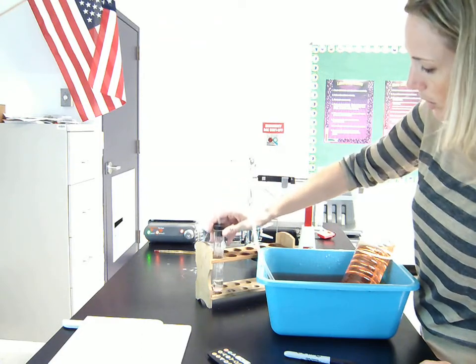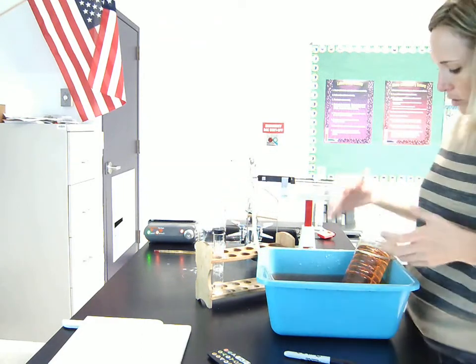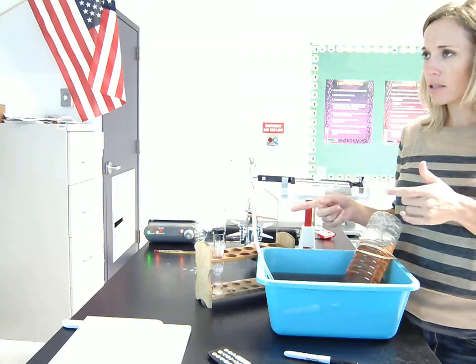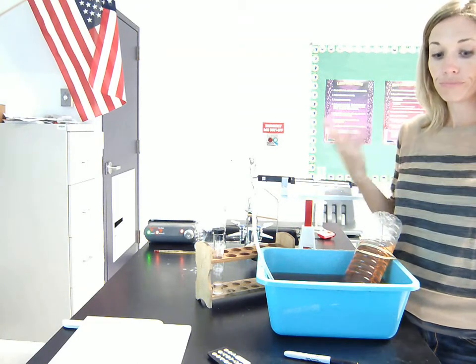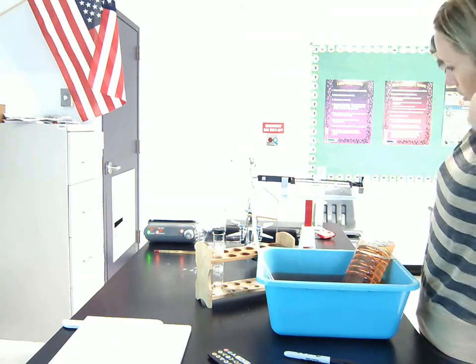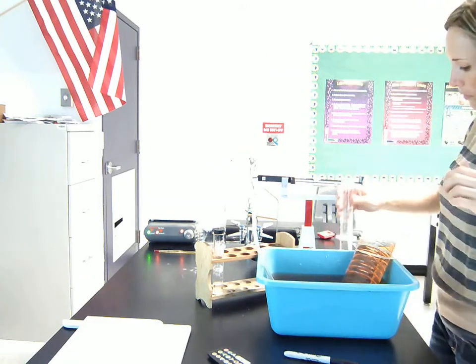Reaction, about as close as we're going to get. So now we're at the part where we've collected our gas, and we need to measure our ending volume and our ending mass, so then we can calculate the mass of the gas, the volume of the gas, and then its density. So let's see. Let's start with the volume of the bottle.